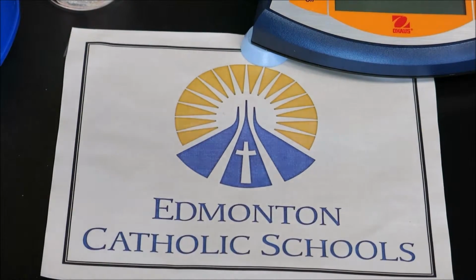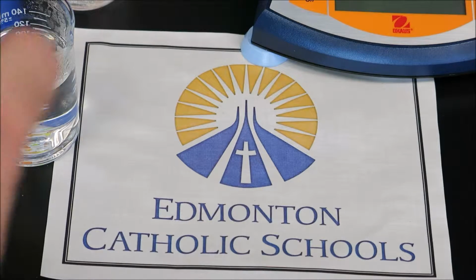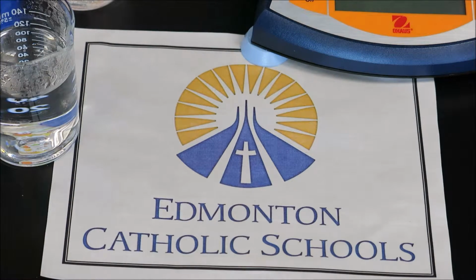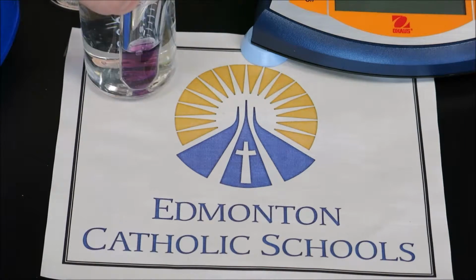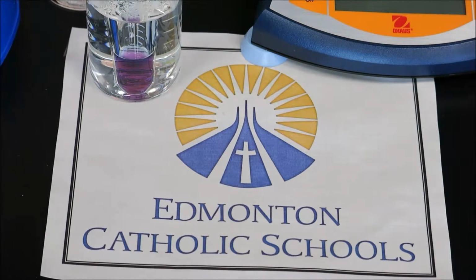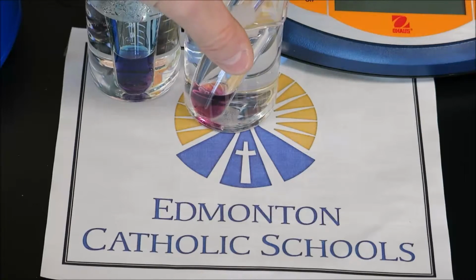Our first stress that we will apply here is increasing temperature. So we take this beaker of water right off the hot plate, and we're going to take a little bit of our sample here, and add it to the hot water, and look for any changes. Now, temperature changes may take some time. However, hot water, of course, being as hot as it is, changes quite quickly.